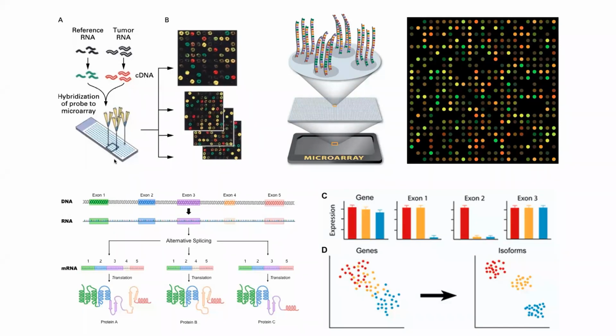RNA-seq can measure the expression levels of thousands of genes simultaneously and provide insights into functional pathways and regulatory networks in biological systems. In addition, RNA-seq can provide novel insights into alternative splicing, unannotated exons, and novel transcripts that have not been previously annotated. Most importantly, such detail has already proven to yield significant discoveries in many research areas.